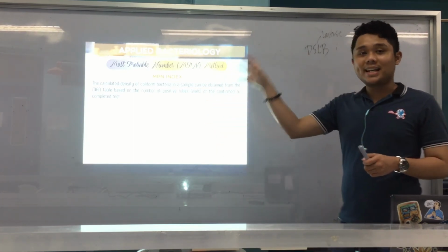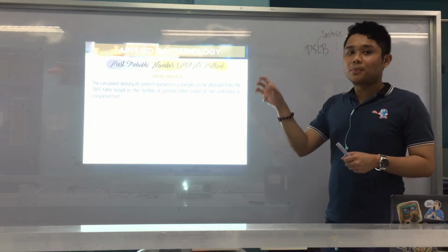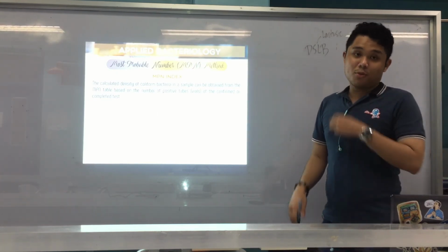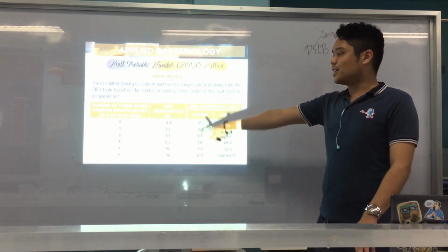So for confirmed, how many EC broth tubes turned positive, or for completed, how many broths did you use here? If you used EC broth, how many broths did you use? Okay? Alright, the ones that turned positive. So again, 0 is less than 2.2.